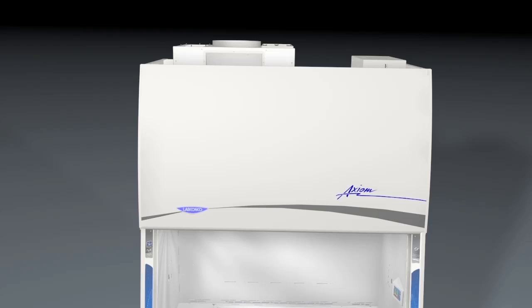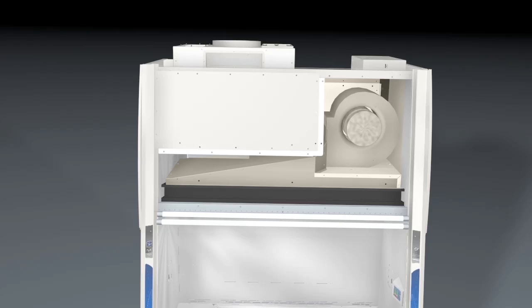The cabinet's supply airflow is physically separated from the exhaust airflow and is maintained through the use of an ECM-driven blower.